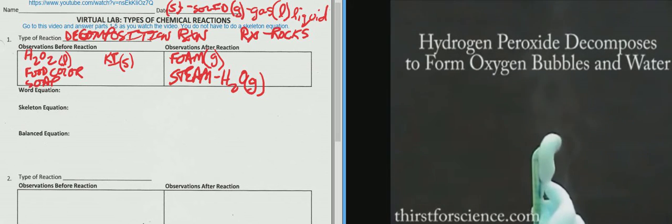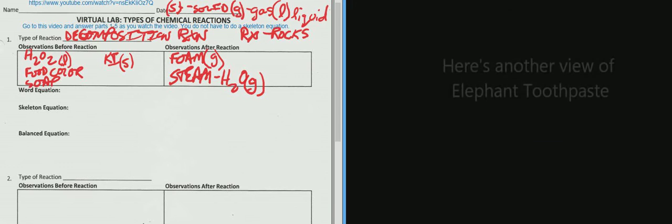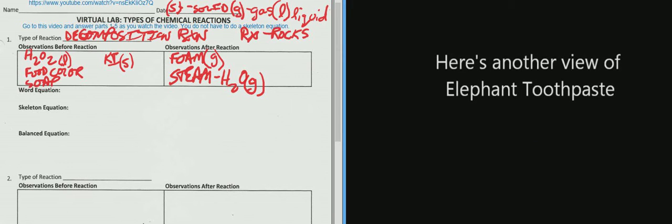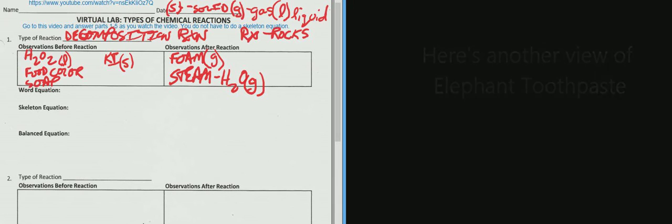So click play again. Hydrogen peroxide breaks down into oxygen. So another view of elephant toothpaste.